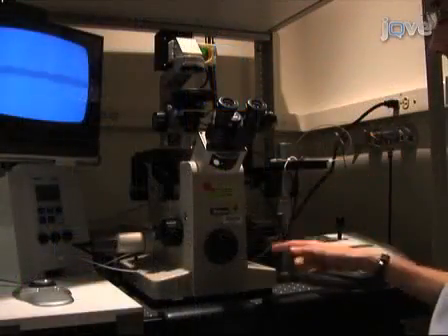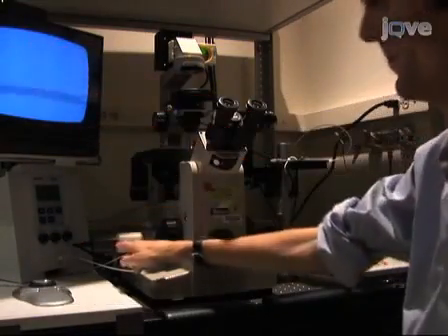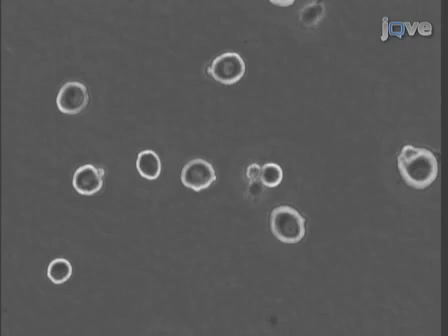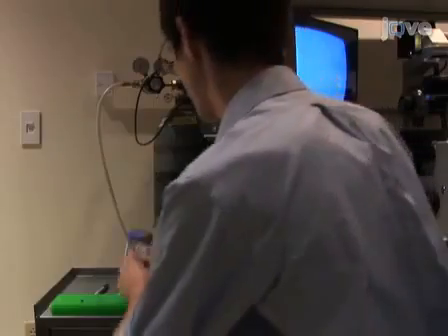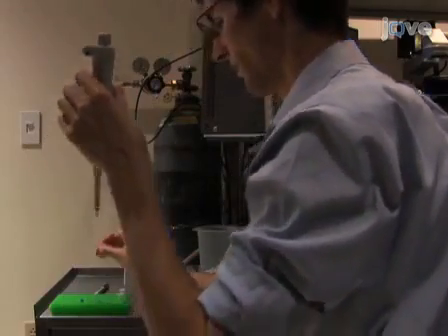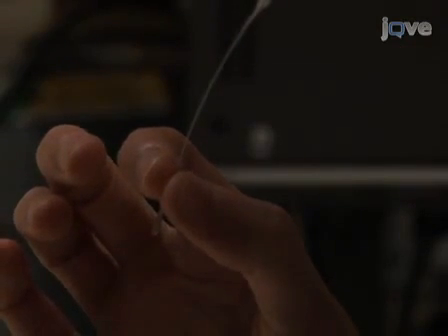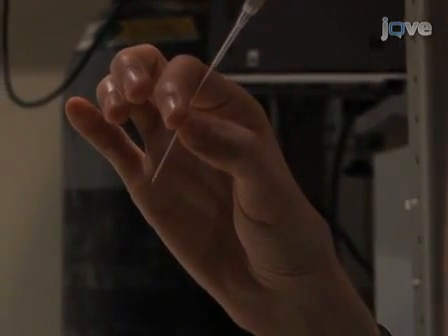The setup consists of an inverted phase contrast microscope, a pressure injector connected to a micromanipulator, and a video monitoring system. Under phase contrast, neurons appear as spherical cells with a clearly visible nucleus as a central round organelle with a dark membrane and may contain a single or multiple nucleoli. Using a microloader pipette tip, draw up two microliters of the prepared cDNA from the hematocrit tube, being careful to avoid the solution near the bottom of the tube where particles may have settled. Transfer the solution into a microinjection pipette. The filament in the microinjection pipette should aid in drawing the solution to the tip, but if small air bubbles persist, gently flick the side of the glass to dislodge them.